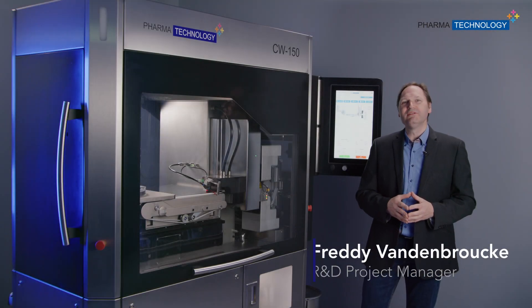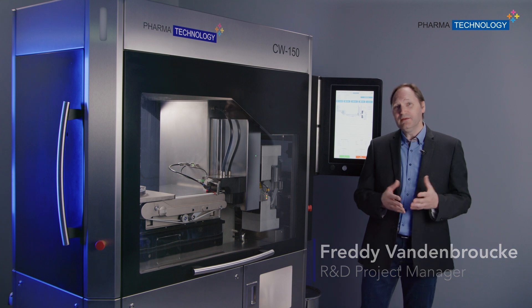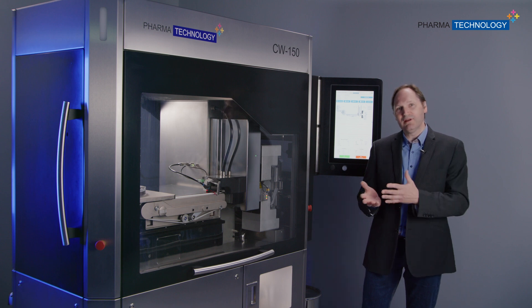Hello everyone, welcome to this video. My name is Freddy van den Broucke. I am project manager for the Q-Control division at Pharma Technology. Today I will talk about the CW150 machine, or 100% checkweigher for tablets and capsules.